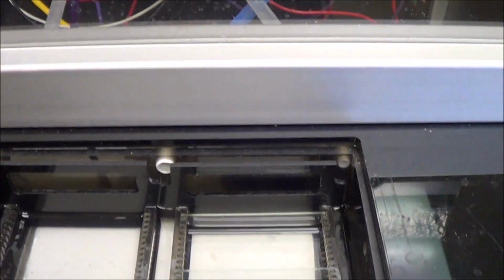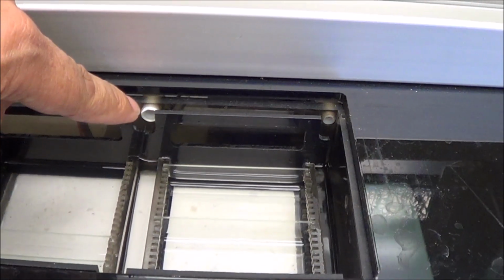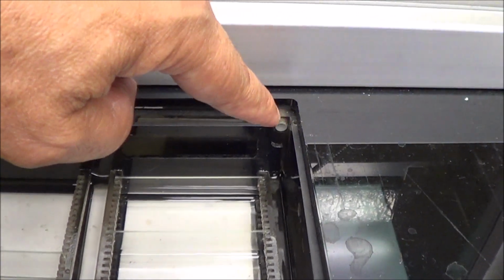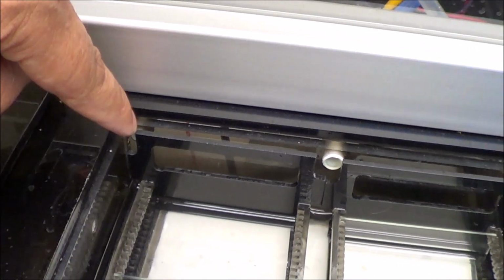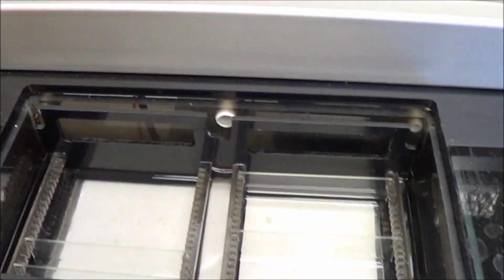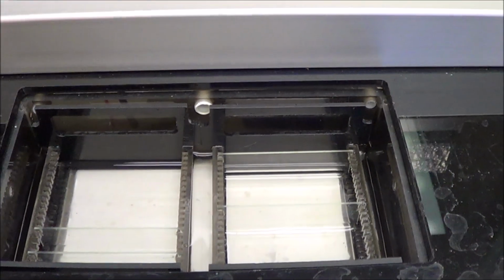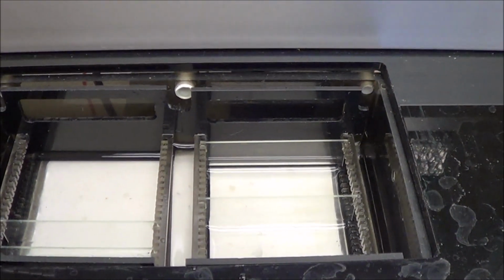There are 3 inlets to the process tank. The one in the middle is coming from the cooling tank. The one on the right that you saw earlier is for the neutralization fluid. And the one on the left over here is coming from the staining fluid holding tank. At this point the cooling is not running anymore. Right, cooling is off.